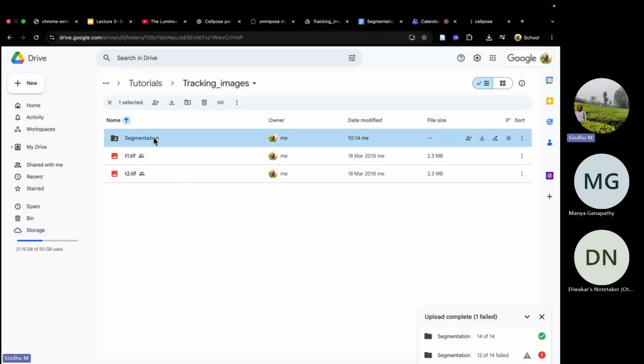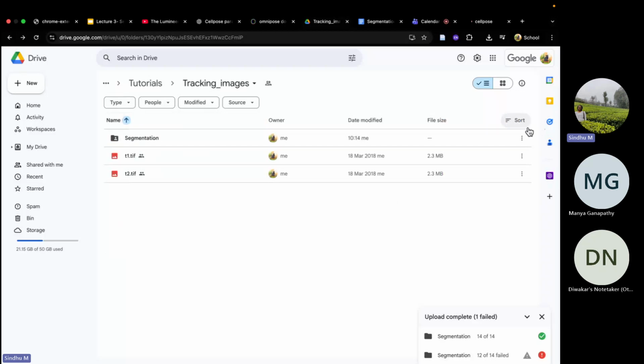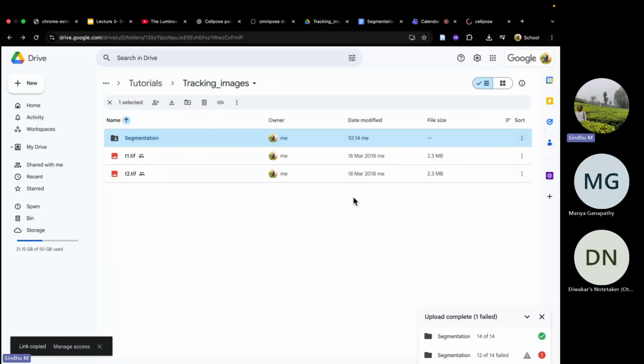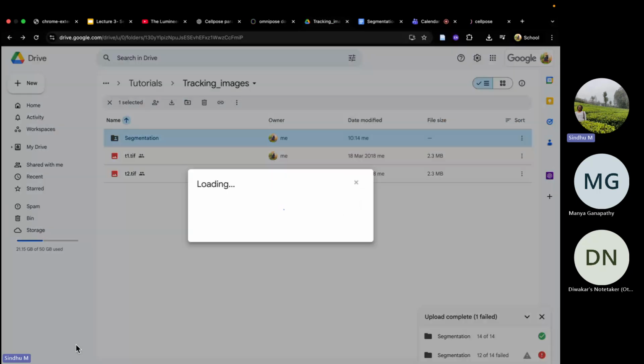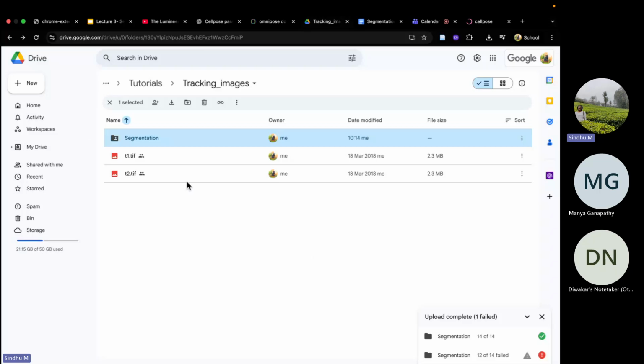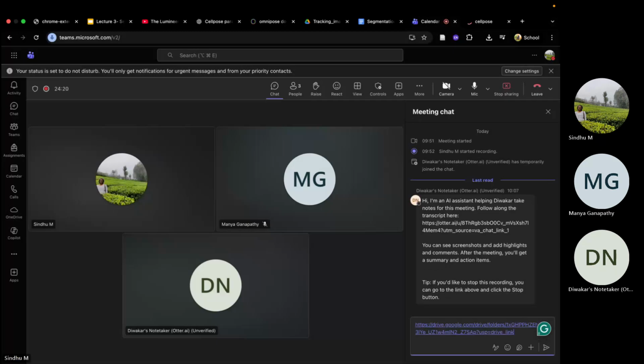Okay, so this has uploaded. I'll just share the link for this on the chat. So those of you who want, you can also follow along with me in this lecture itself. Otherwise, we will also have a separate tutorial session for this, and for that also, we will be using the same images. So if you're not able to do it today, you can also do it later in the tutorial session.